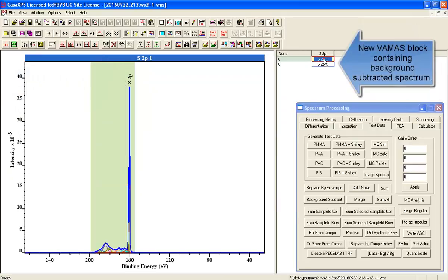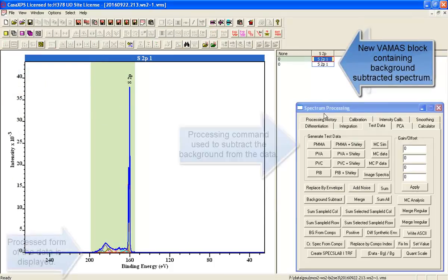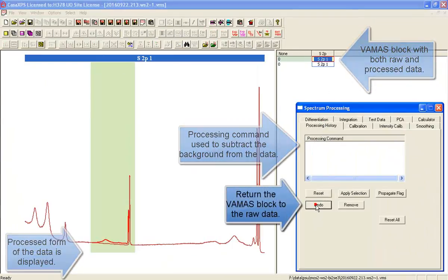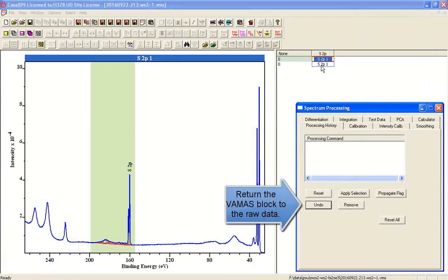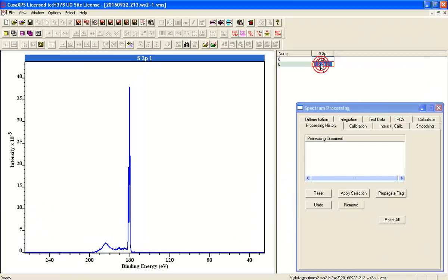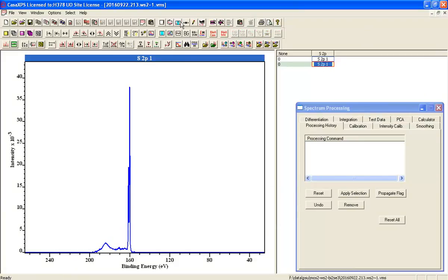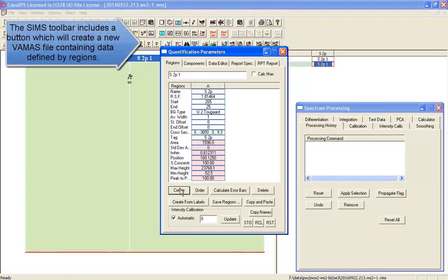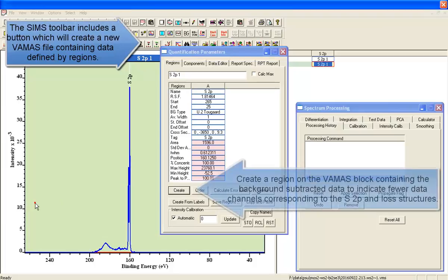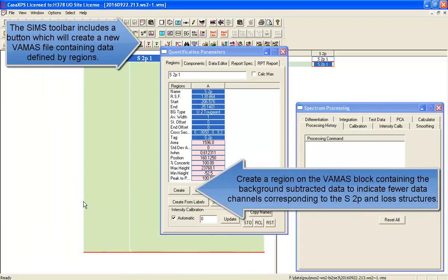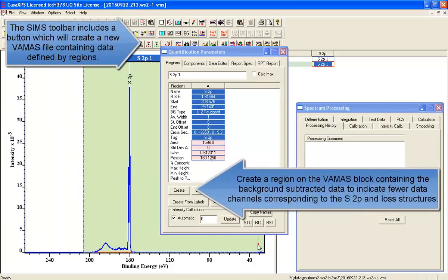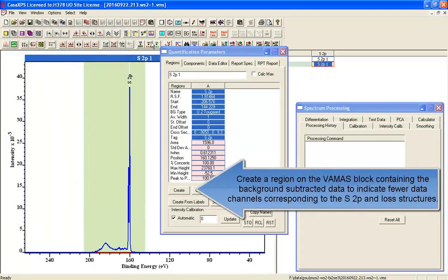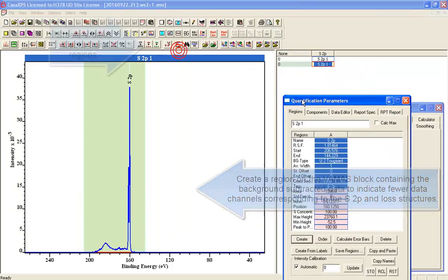So what we've done is we've created the background subtracted data, we've copied it, so we now have a VAMAS block that contains the processed form which will be the background subtracted form of the data. We're going to define a region so that we can pick out only the data bins of interest to us.